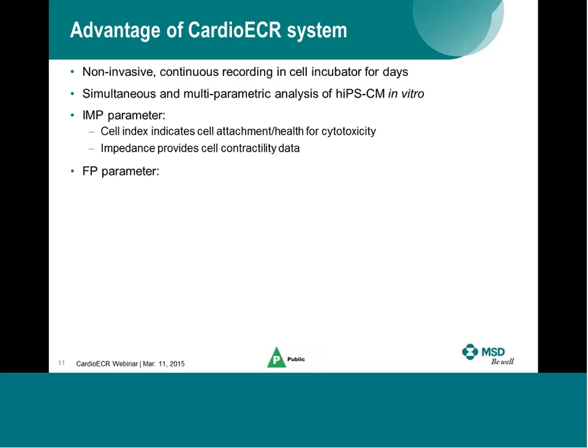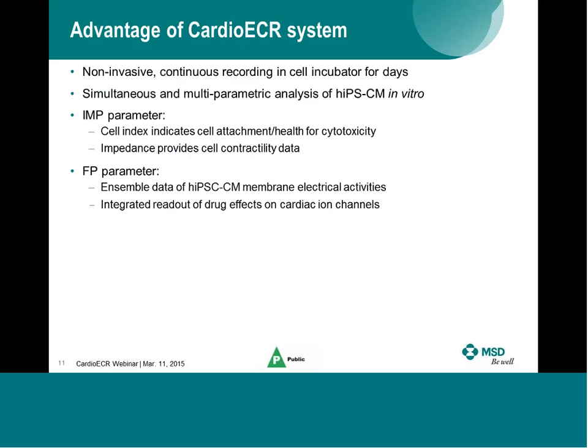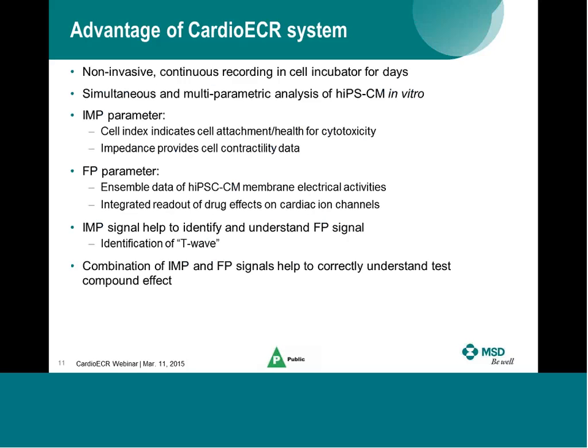From the field potential parameters, we get ensemble data of stem cell-derived cardiomyocyte membrane electrical activities, and it's an integrated readout of drug effect on all cardiac ion channels expressed in those stem cells. And also, the impedance signal can help to identify and understand field potential signals, for example, the detection of the T wave. I will talk in more detail about this one in the following slides.